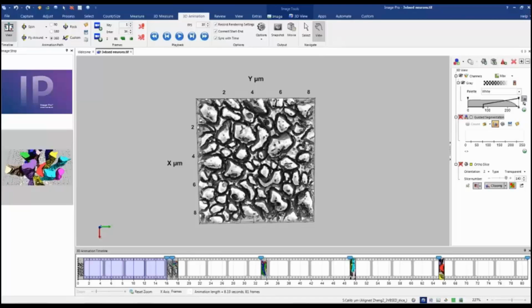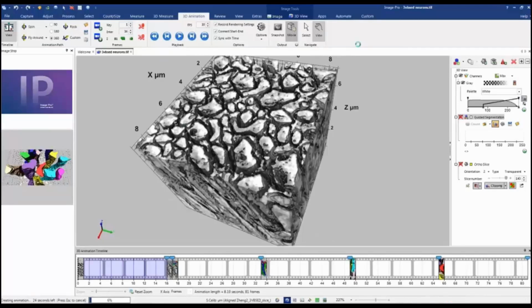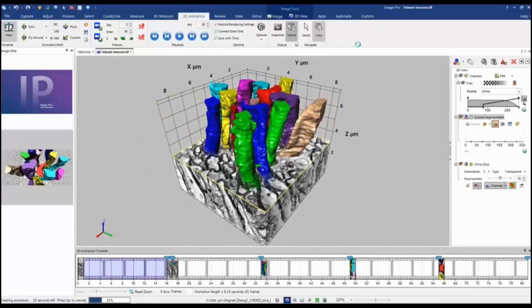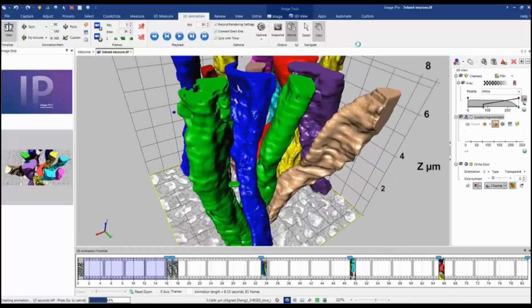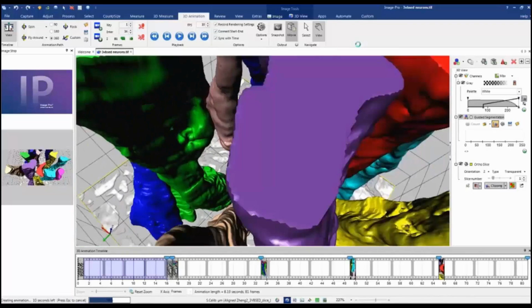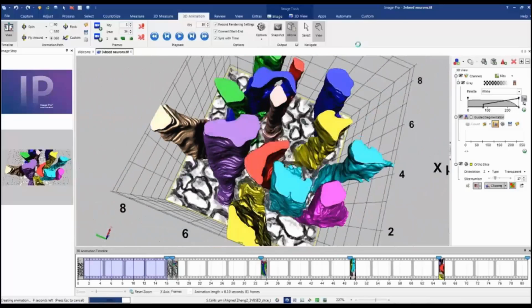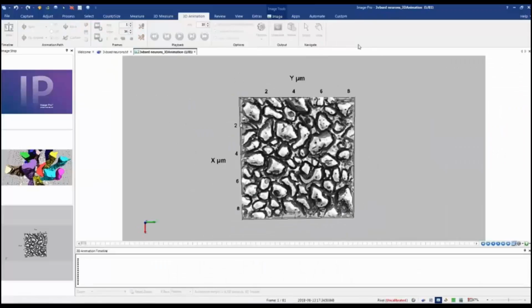So to create animation with the current size, we simply click the movie button, and now the program will create our new animation with 81 frames using all the transitions we just recorded. So now we are flying in, going up, and now we are returning to the initial position based on this connect start and frame.